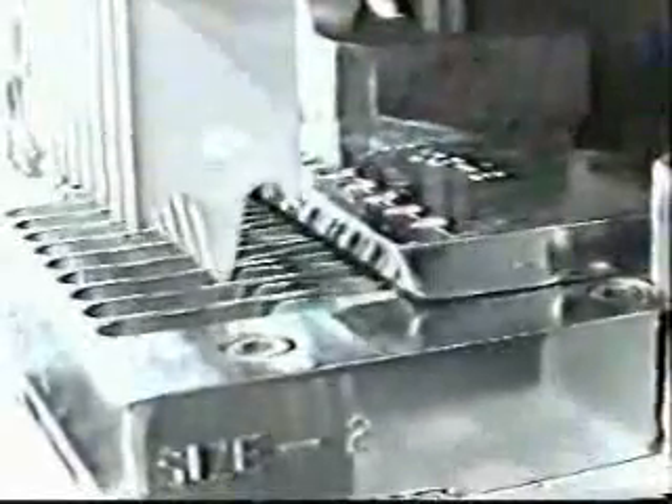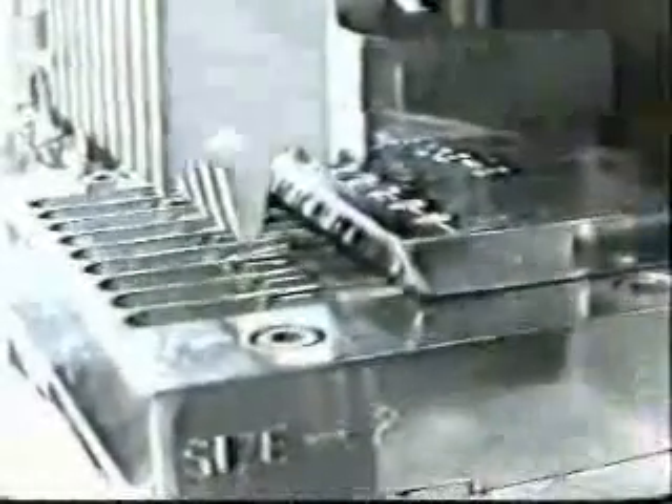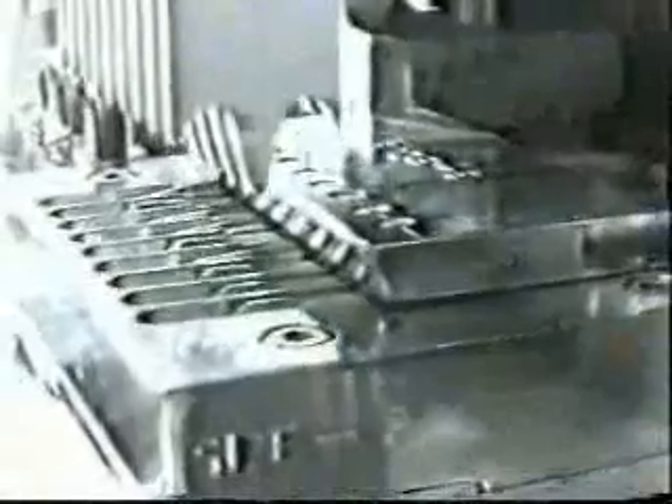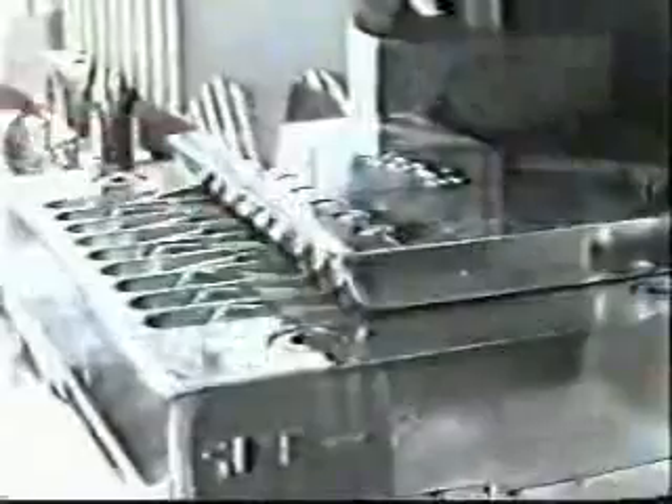One capsule from 8 row is released into the slot of the raceway by means of release fingers. The capsules are then pushed forward to a present position in the raceway by means of an adjustable push plate. The pushing fingers descend, turning each capsule cap up, body down, and load them into the aluminum loading ring assembly.